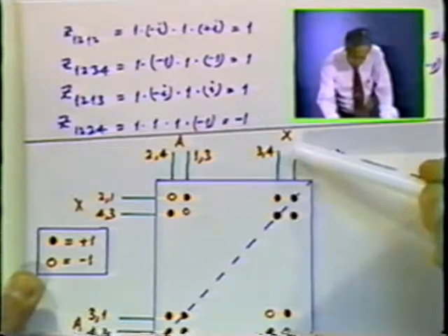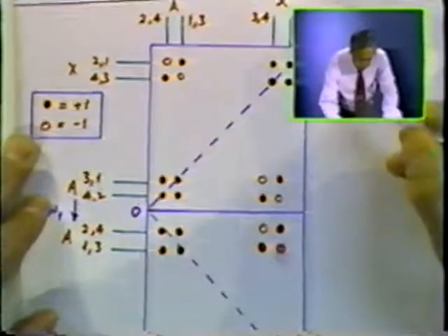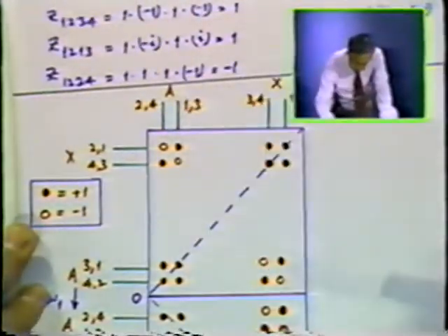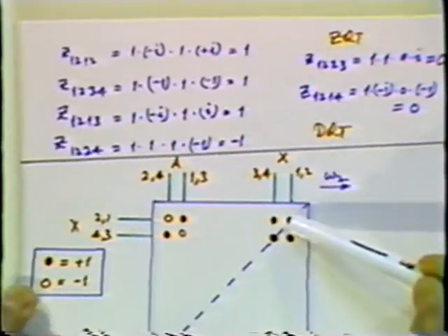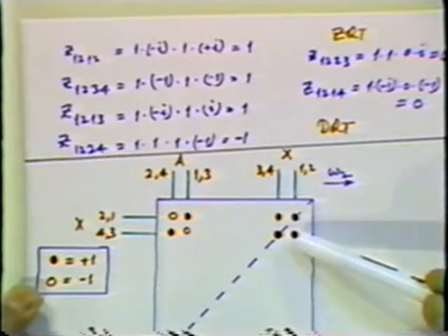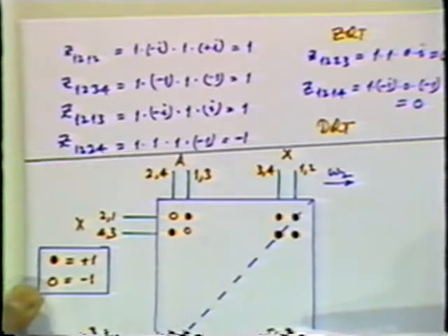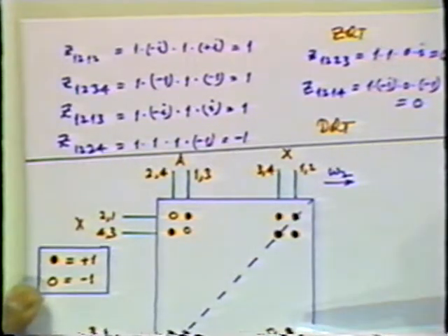So they refer to the peaks along this line. And the intensity omega 1,2,1,2 is for the 1,2,2,1 transition, which is right here. This is 1,2,3,4, that means 1,2,4,3, and that's this one, also plus 1. And 1,2,1,3 is this transition, which is omega 1,2,3,1. This is given in the notes as minus 1, but that should be plus 1.